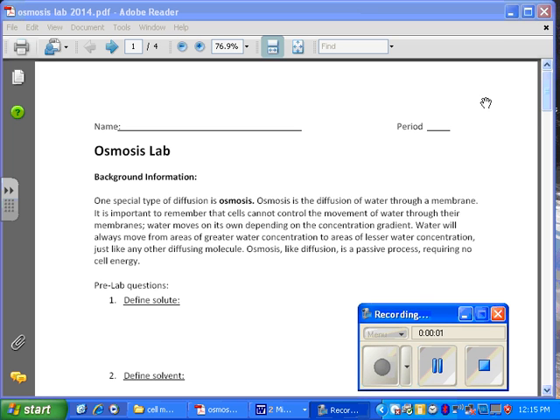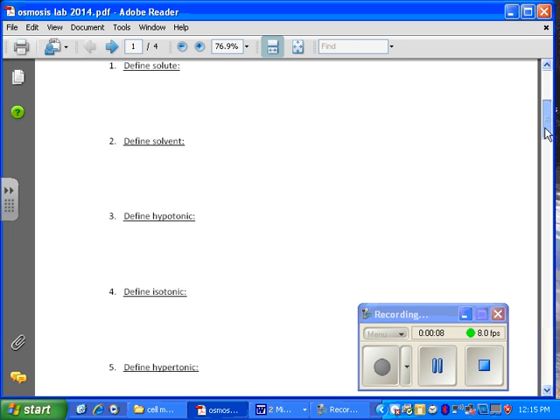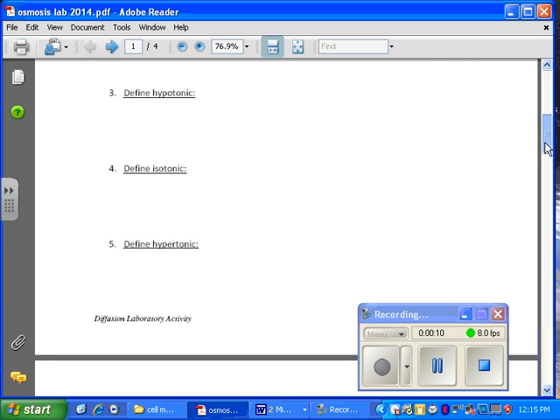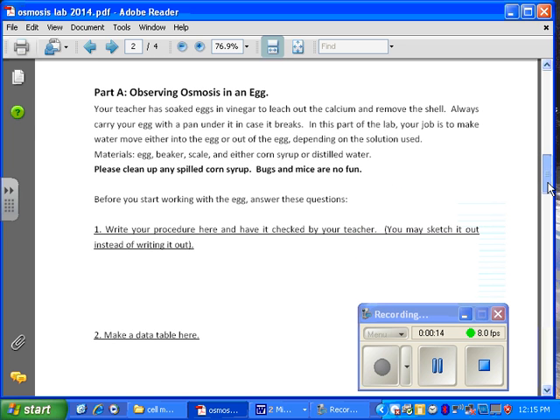This video was made for any student who missed the osmosis lab. On the front page, you have a bunch of terms to define: solute, solvent, hypotonic, isotonic, and hypertonic. So define those from your notes. And what we're going to look at now is how to do the lab itself.